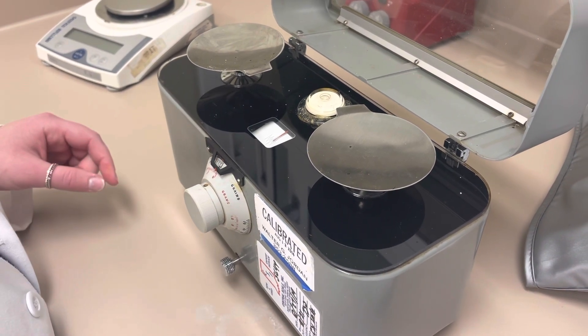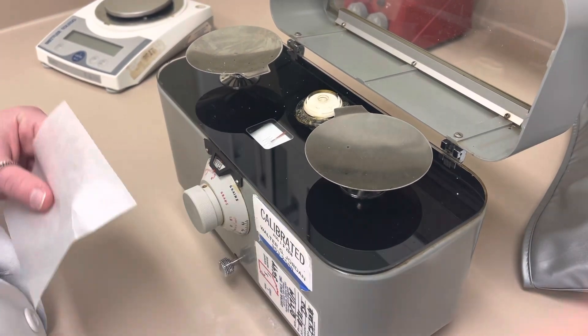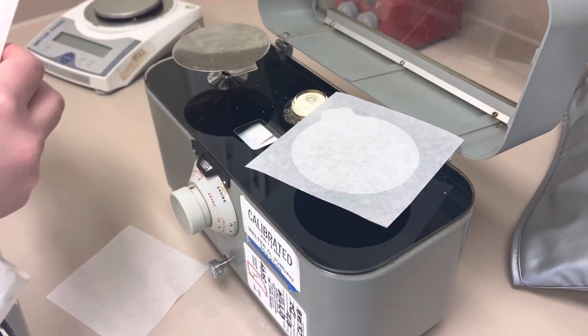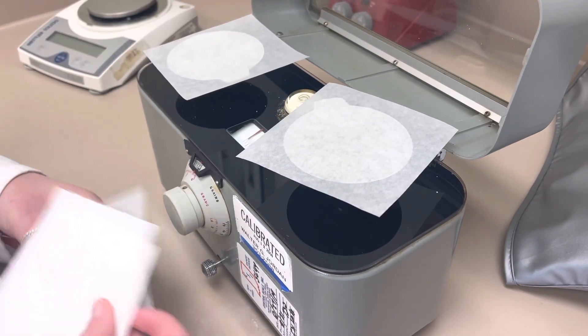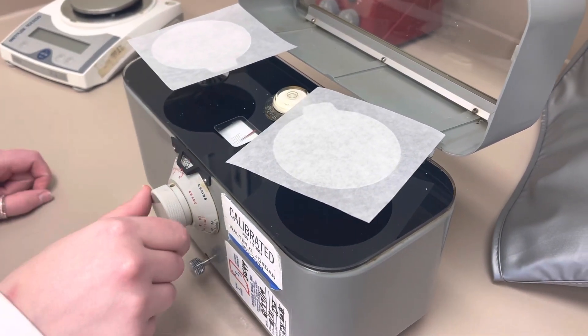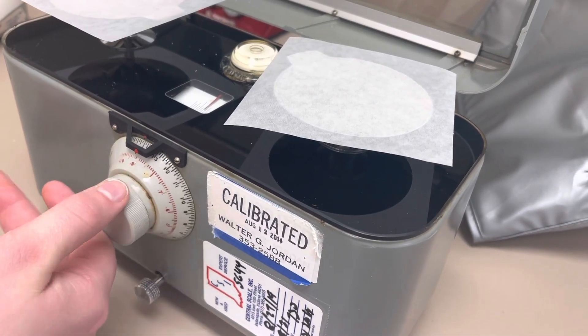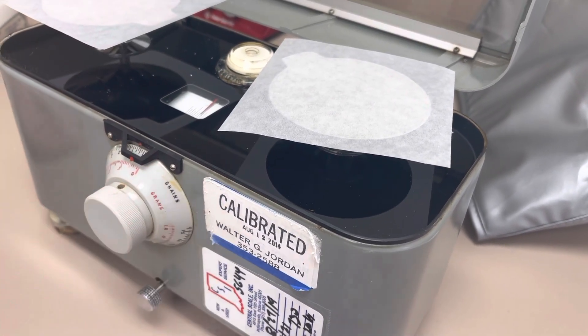Once it's in the middle, you're going to use weigh papers — you always want to put weigh papers on both sides. Then you can dial up to whatever weight you want. It starts at zero and goes up to one gram. If it's under one gram, you always want to use the torsion balance.